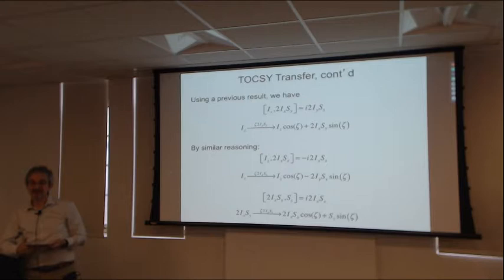So just turning down the RF power by itself doesn't work. You have to do something more sophisticated.